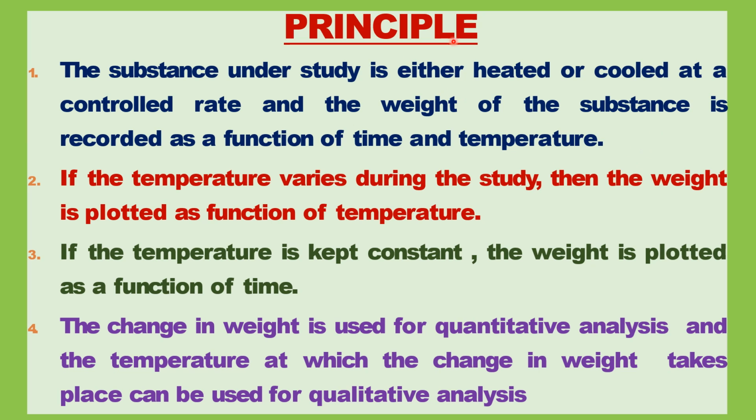We have earlier seen that if the temperature varies during the study, then the weight is plotted as a function of temperature. If the temperature is constant, the weight is plotted as a function of time. The change in weight is used for quantitative analysis, and the temperature at which the change in weight takes place can be used for qualitative analysis.